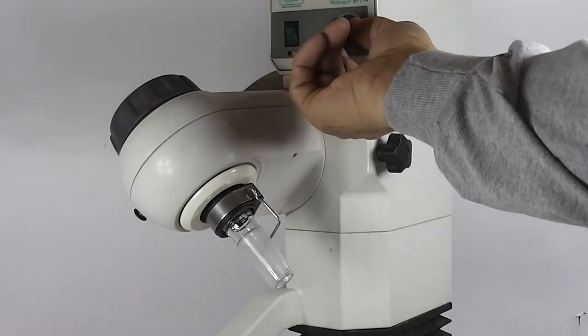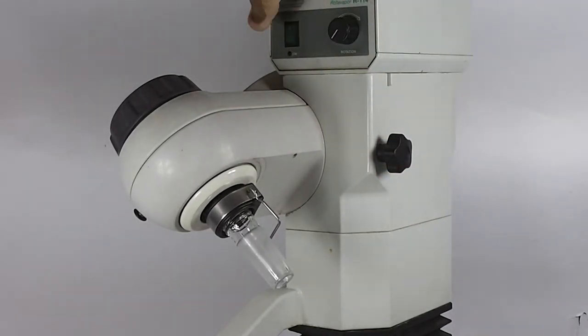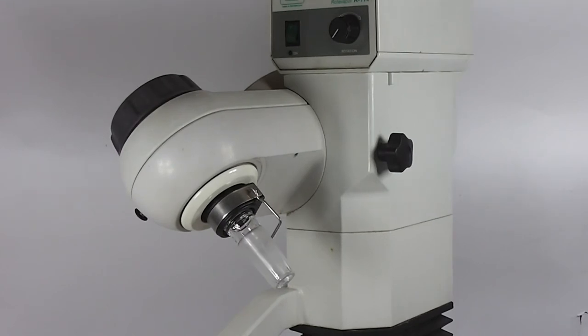I am going to turn off the unit. That is the Buchi Rotavapor R114.